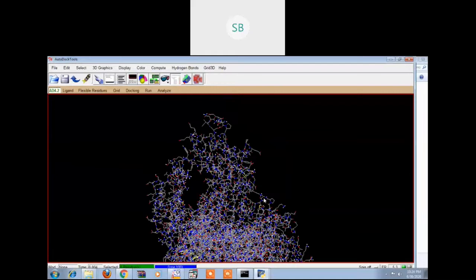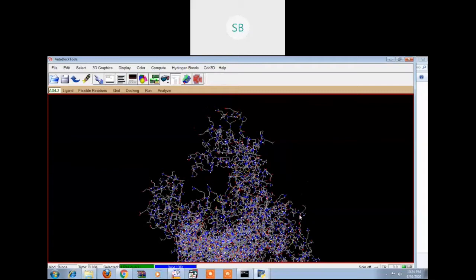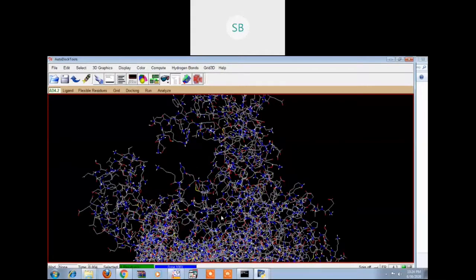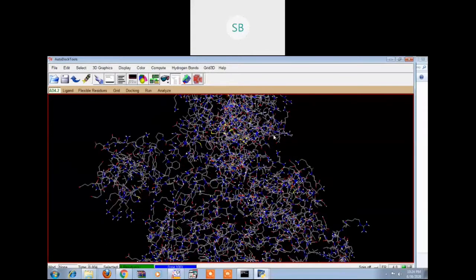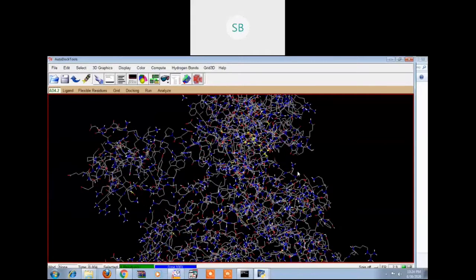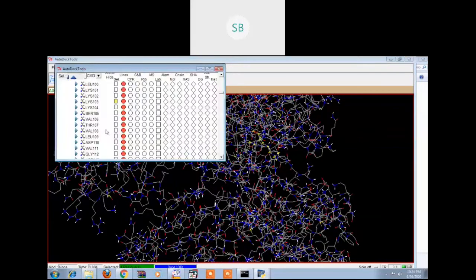Okay. You see a portion of it is glowing, or highlighted, right? Let me do one thing. I can just take it to this area. Yes, so this is the area where lysine is there. If we further zoom it, this is found to be the lysine. I'll just show you once again.